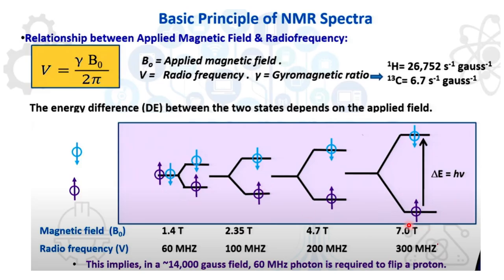So you provide that high amount of magnetic field, because the magnetic moment generated by that spinning species, the proton, is very small. That's why you need a very high magnetic field, so that the difference will be large, otherwise it will merge with other elements. We will discuss what coupling takes place.